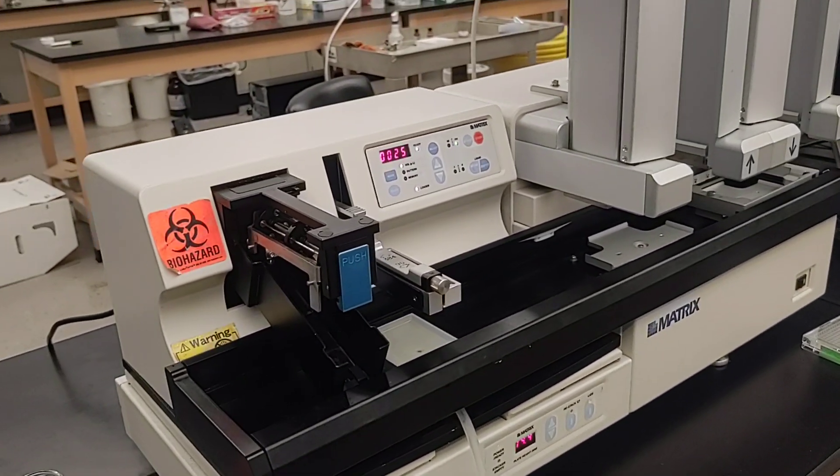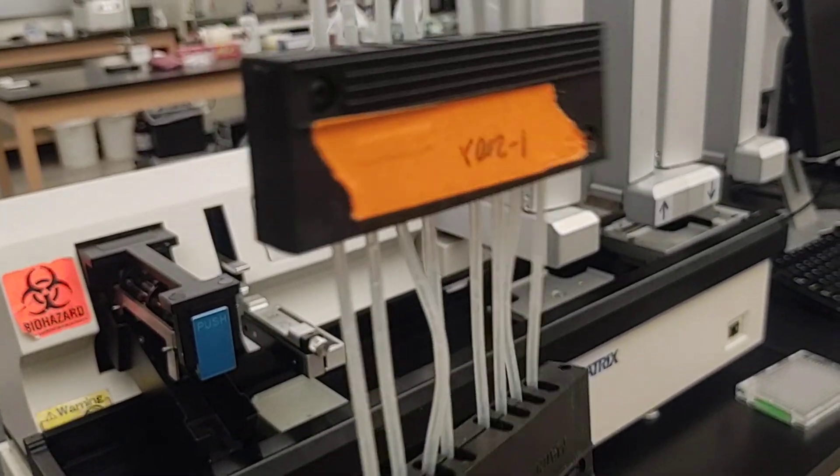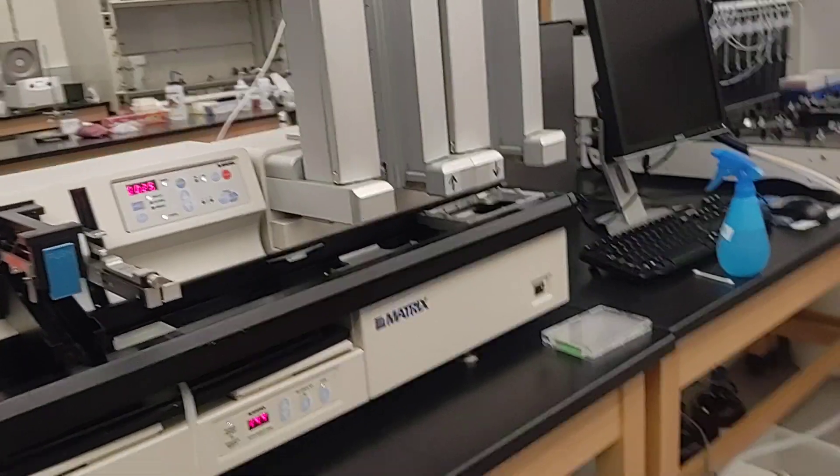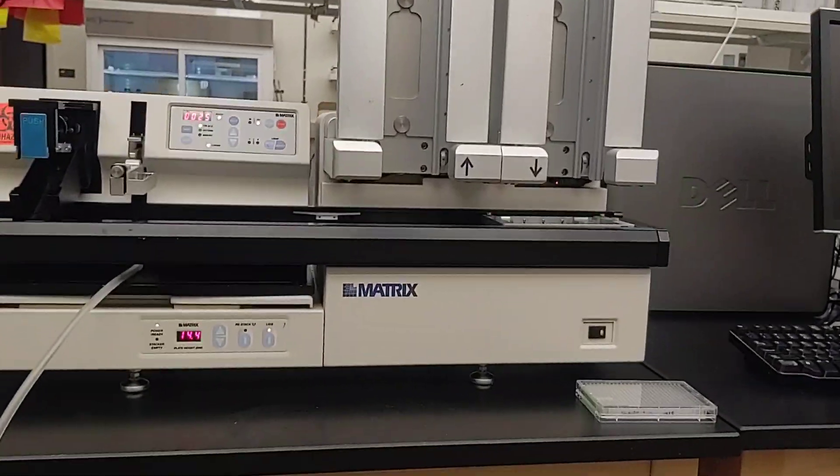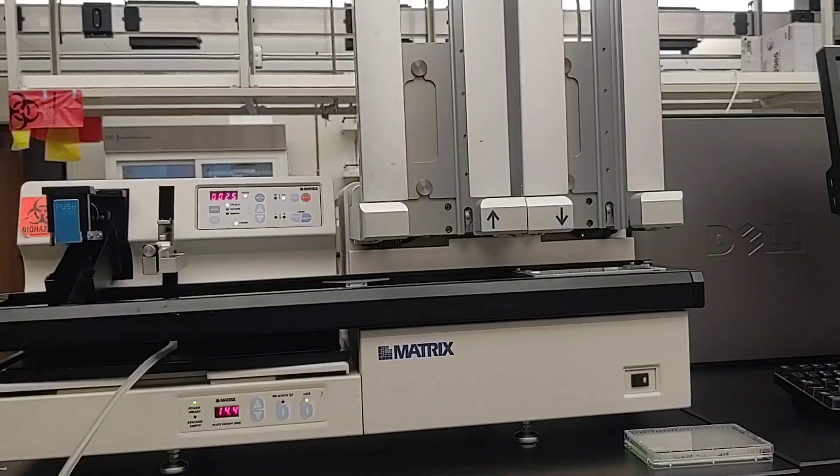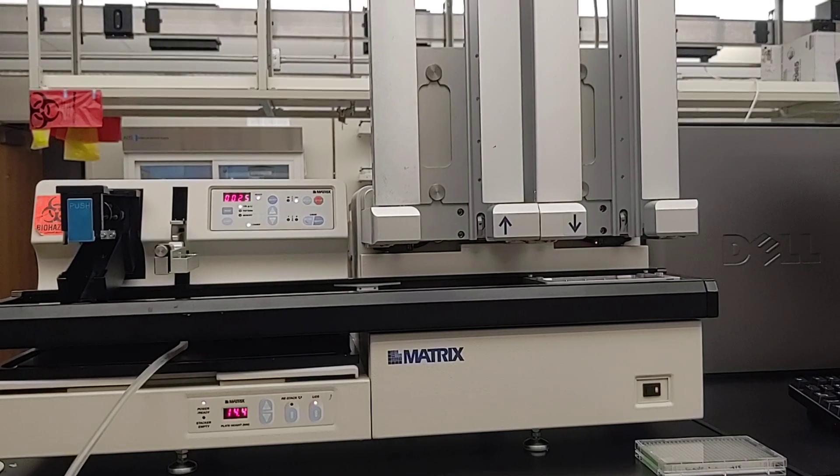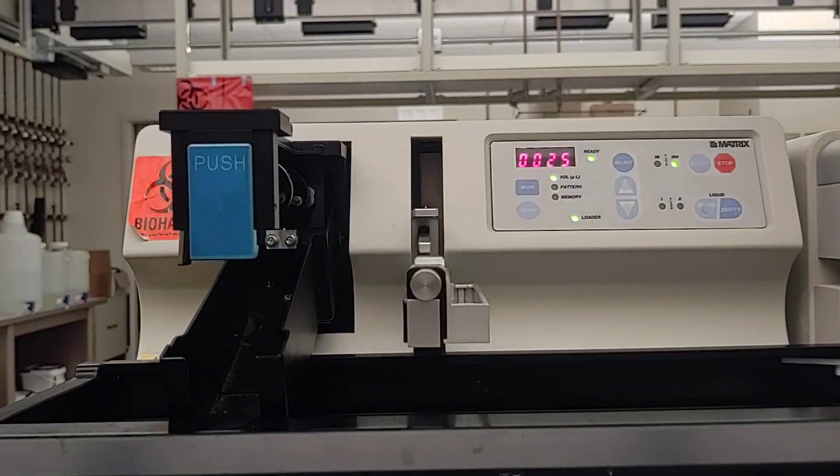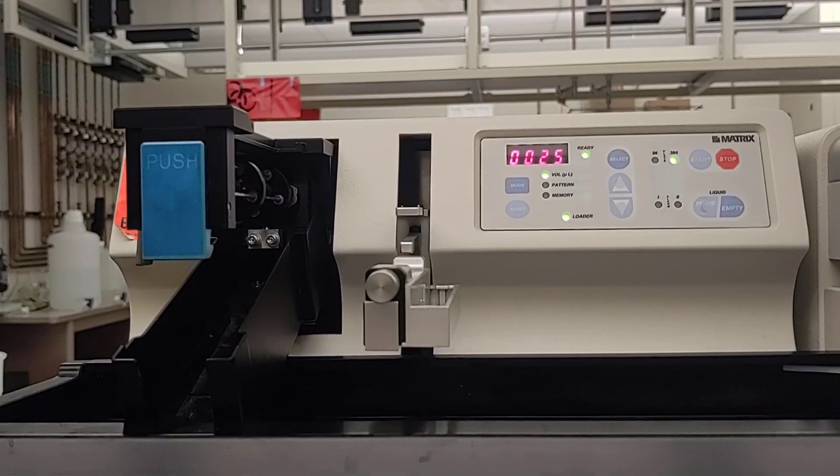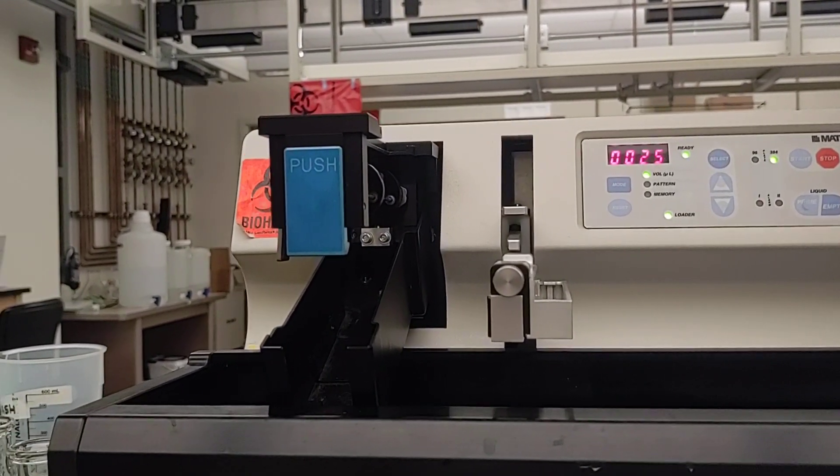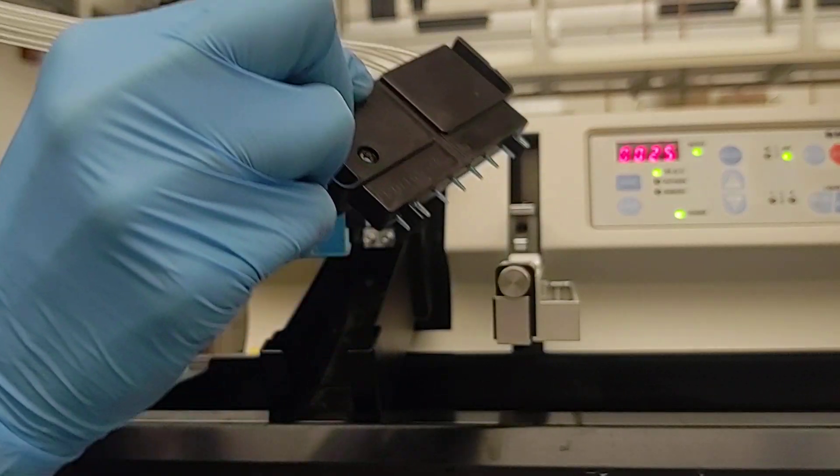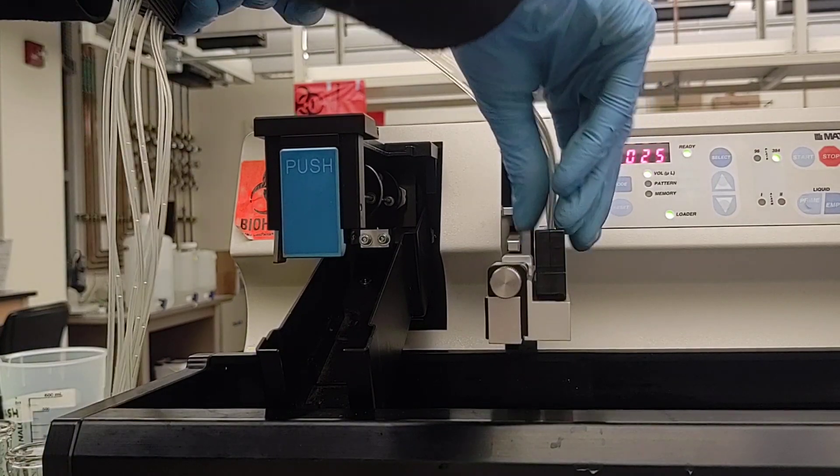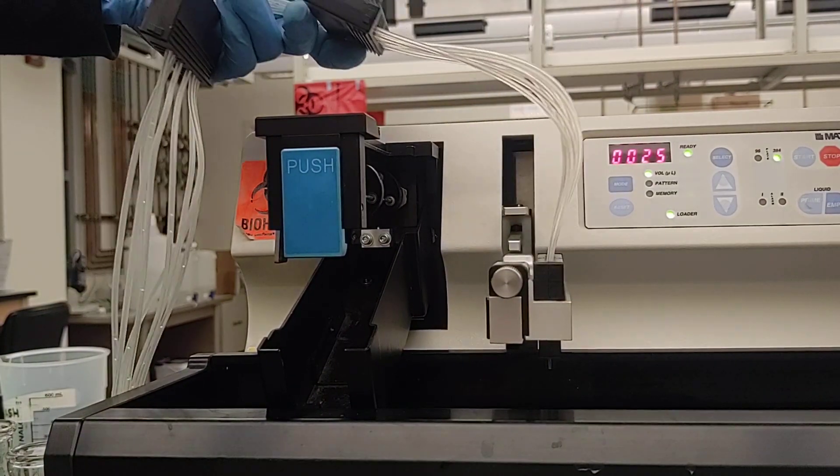And this is the cassette we're going to use for 1 to 200 microliters. So to load the cassette, you start by putting the spout end into this holder there. And it just clips into place.